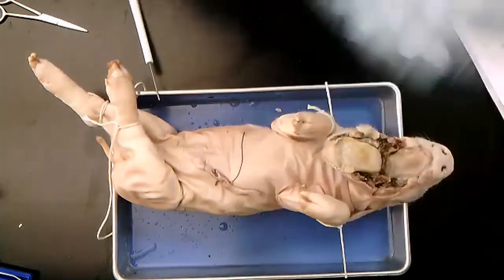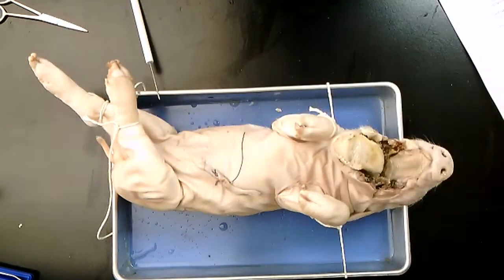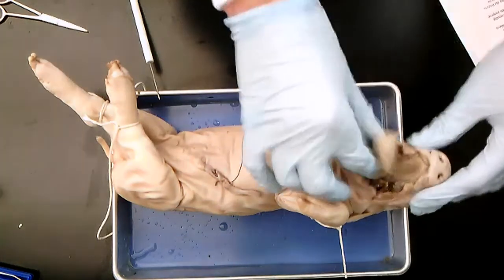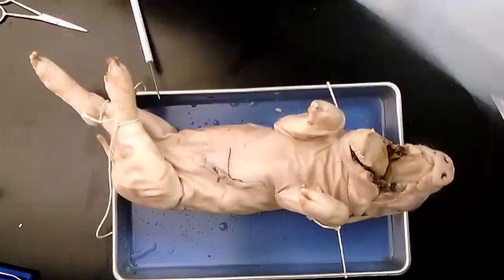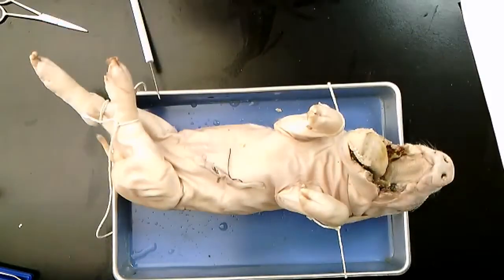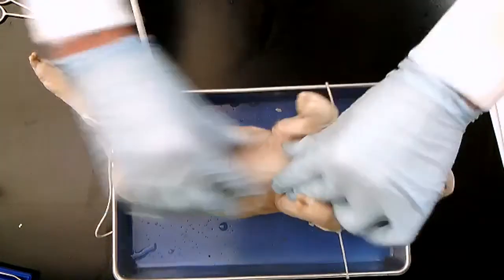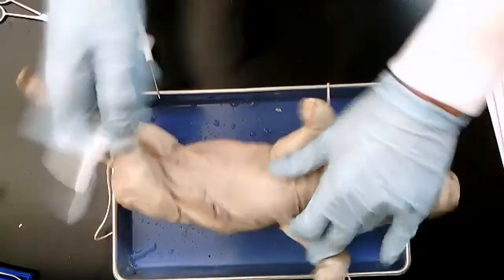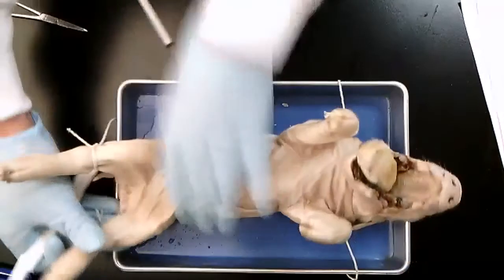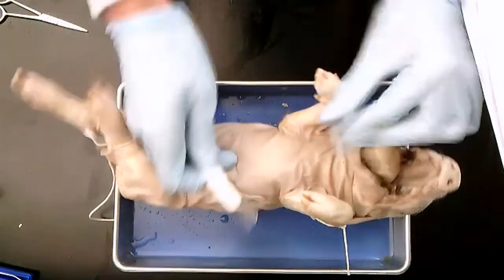So any questions about the mouth cavity? All right. Hopefully the mouth cavity is pretty straightforward. So then we'll move to the fun part of the dissection, where your students get the opportunity to learn how to dissect the abdominal cavity. So the instructions are step-by-step and give precise directions. I am going to show you what it looks like.